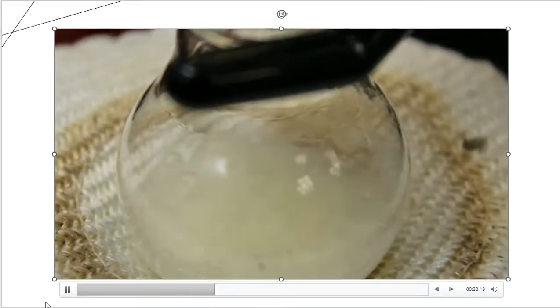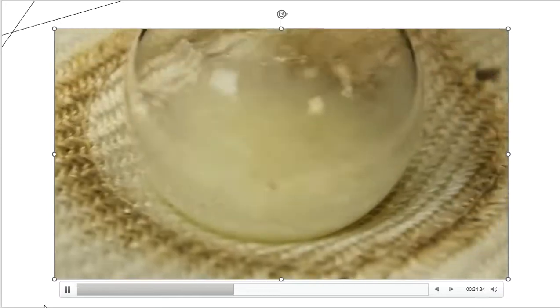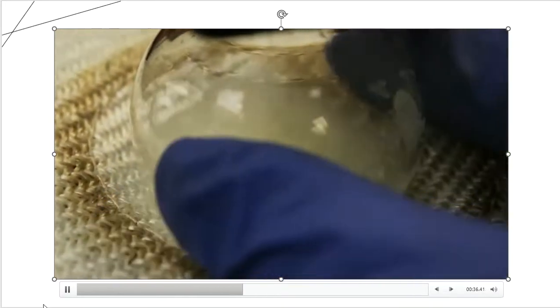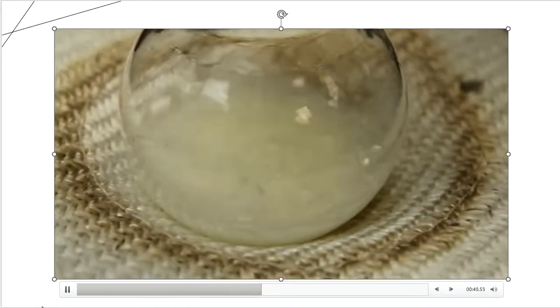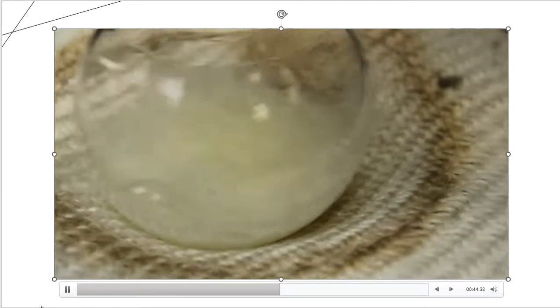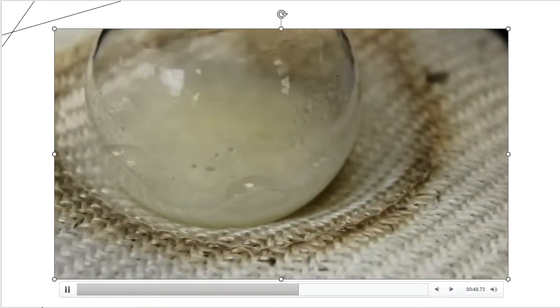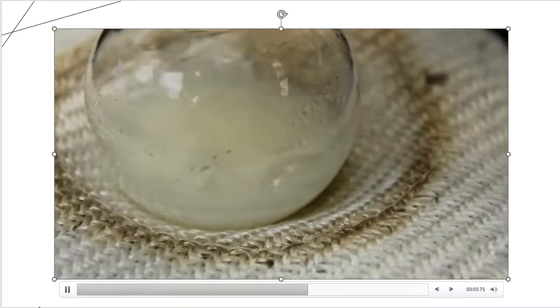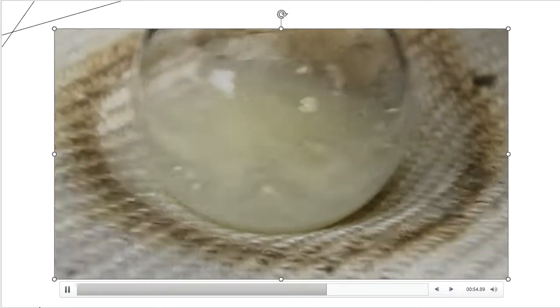Meaning that this stuff is kind of boiling on its own at this point. It's generating its own heat, and that heat is beginning to warm up the flask just a little bit, but not much at all. So the aluminum chloride is doing what the aluminum chloride is supposed to be doing, and my reaction is now taking off. So here they are madly falling in love. They are making some product babies at this point, and I need to give them 30 minutes alone in the jacuzzi tub before I bother them anymore.